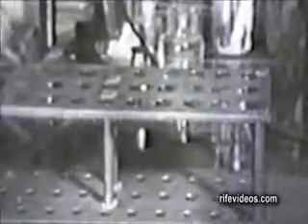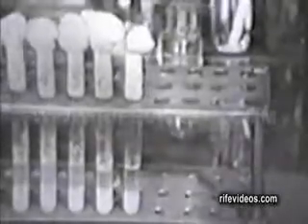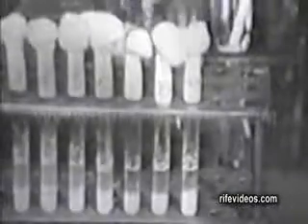The test tubes were placed in a 2-inch water vacuum and irradiated for 24 hours as they progressed up the test tube holder. Everything is flamed to sterilize the bacteria, to sterilize the cotton that held it, and the solutions. Every time one test tube disappears, it means that there's an elapsed time of 24 hours between the radiation of the lights.